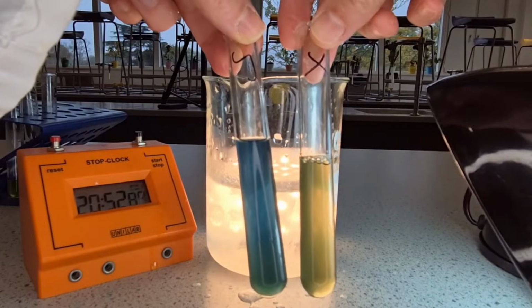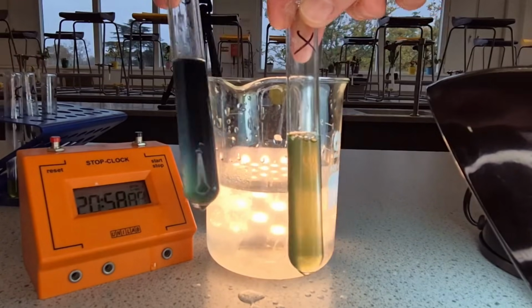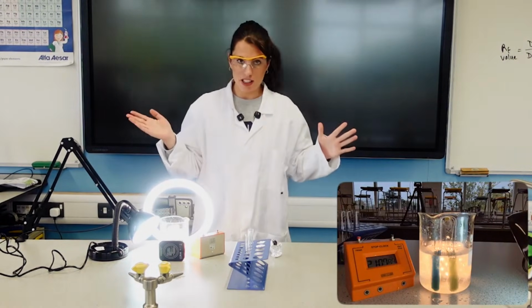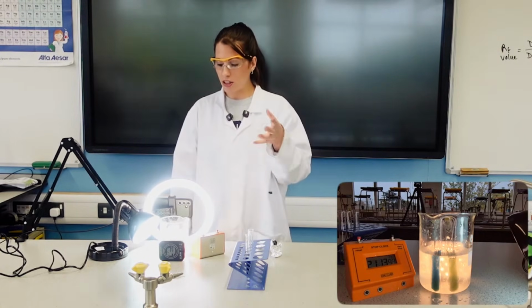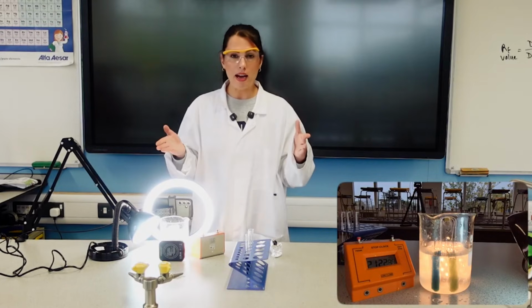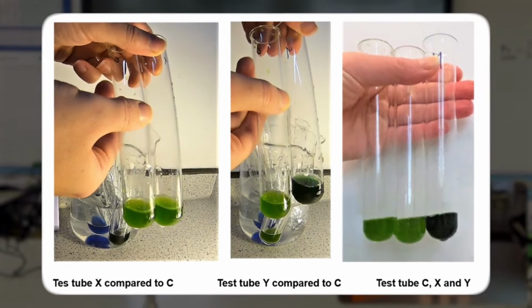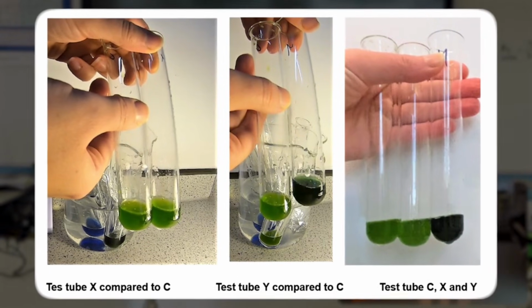It's still not completely the same colour as my colour standard, and Y is nowhere near that point yet, and we're at 20 minutes. Now, I have found in the past that my Y tube never changed colour. I even left it running after the students finished the lesson, and said I'll give you the data later. It could be that the concentration of the ammonium hydroxide was so high that it denatured all the enzymes, so the reaction didn't happen. If that's the case, I wouldn't worry about it too much, because the students just need to have an understanding of the theory. Then in the next lesson, if you're doing the write-up, you can provide them with a set of results for tube X and tube Y, so they can still go on to do data analysis and statistics based on that set of data.